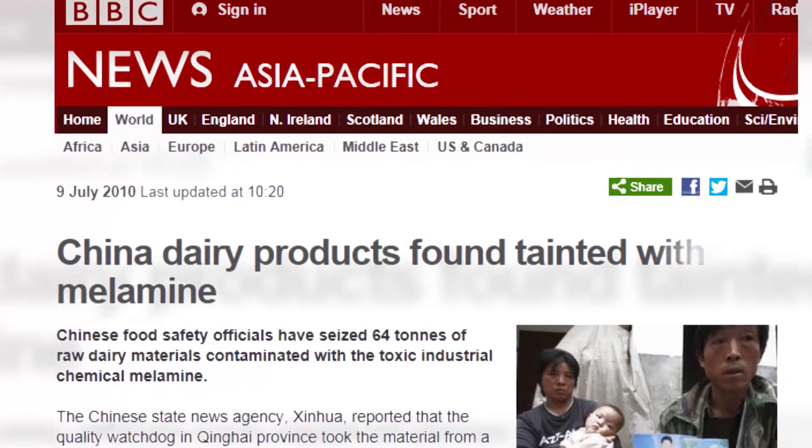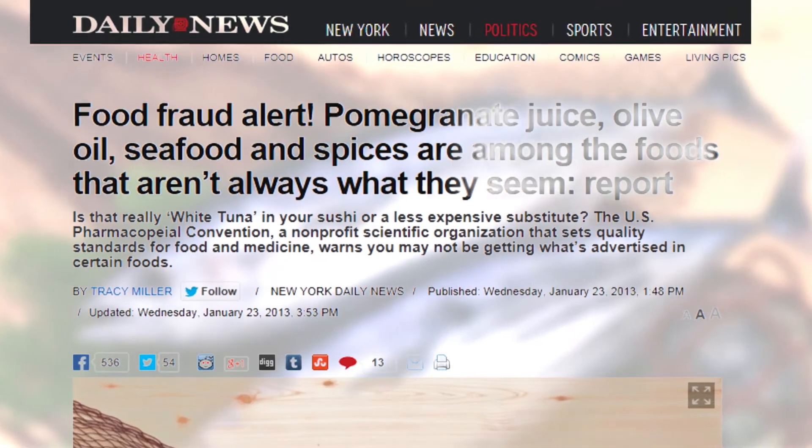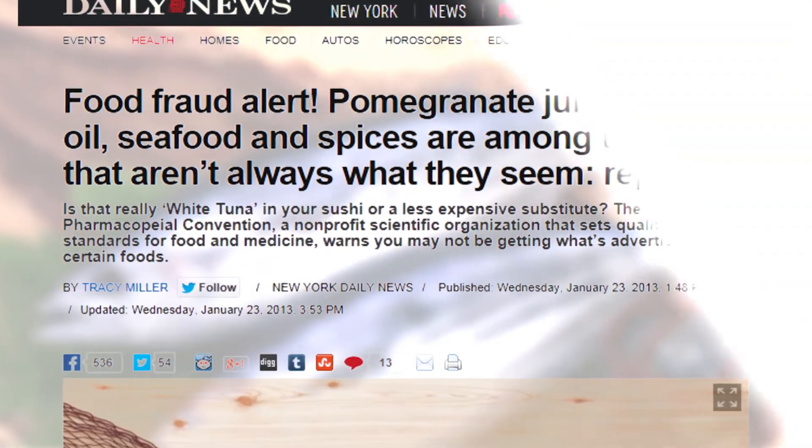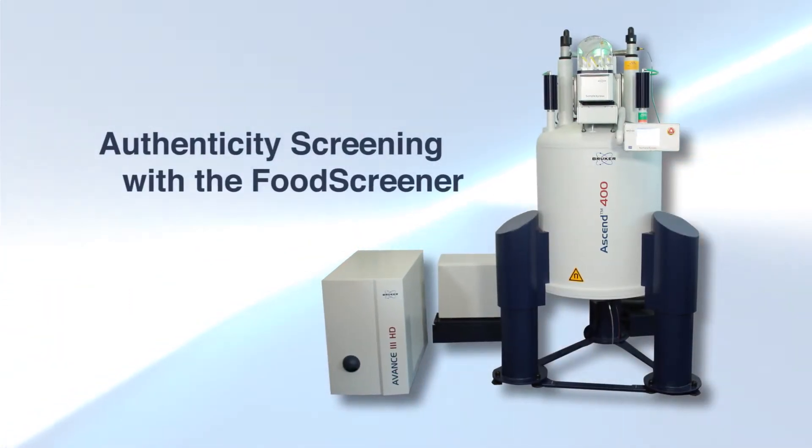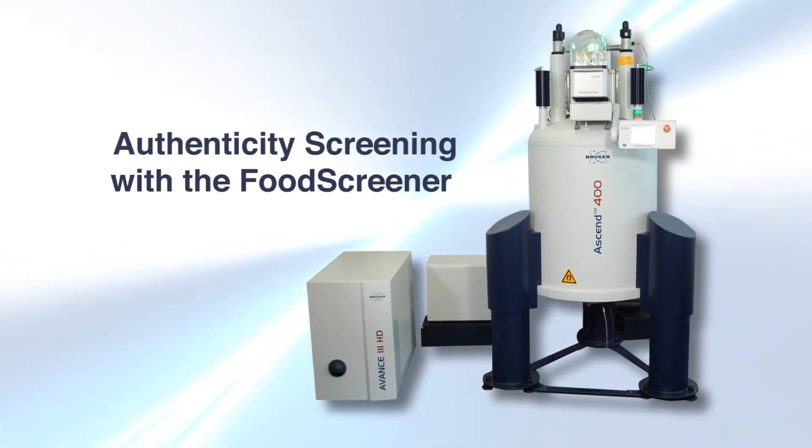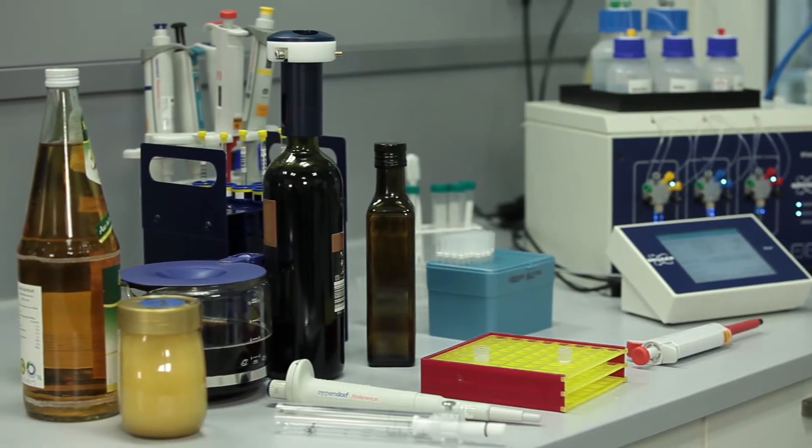Problems in food authenticity are increasingly making headlines. With Bruker's fully automated magnetic resonance based food screener, a tool to ensure the quality of our food conquers the market.